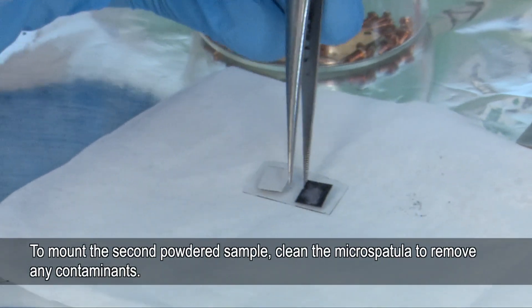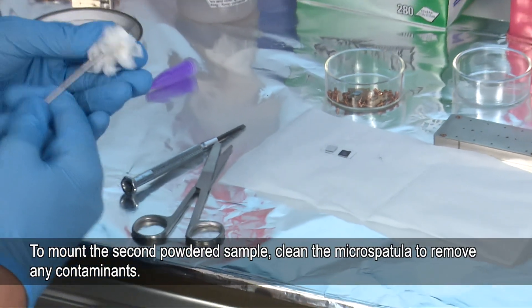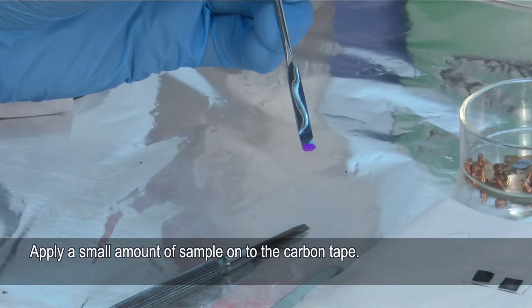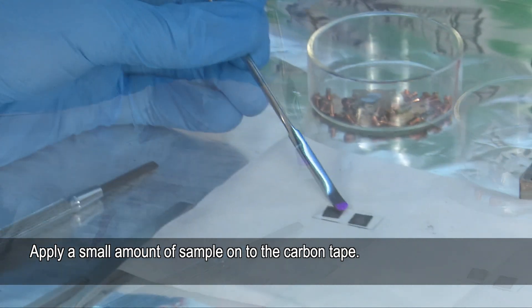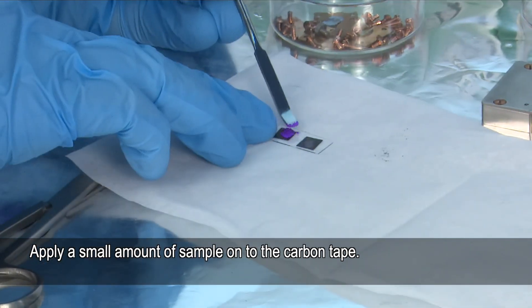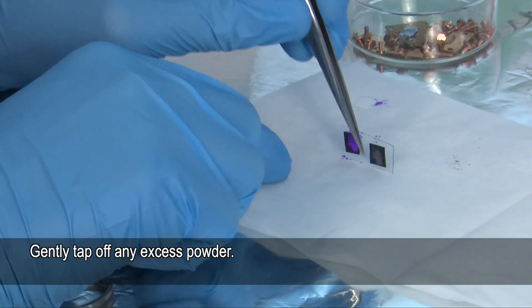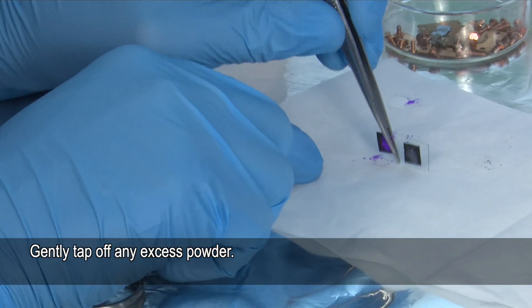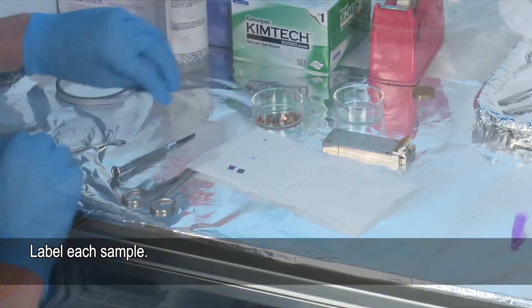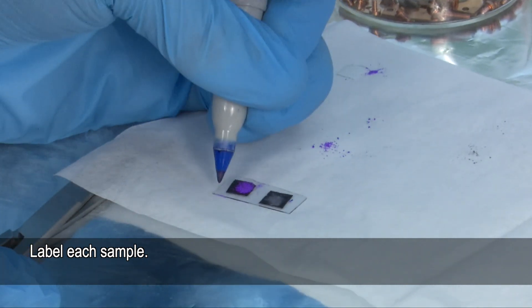We'll now prepare the second sample, so we need to clean the spatula first just to remove any contaminants. The same as before — very gently peel back the tape. This is more than enough powder, so a very small amount. Smear it across. We're just going to label all of these so we remember which one is which — so this is number one and this is number two.